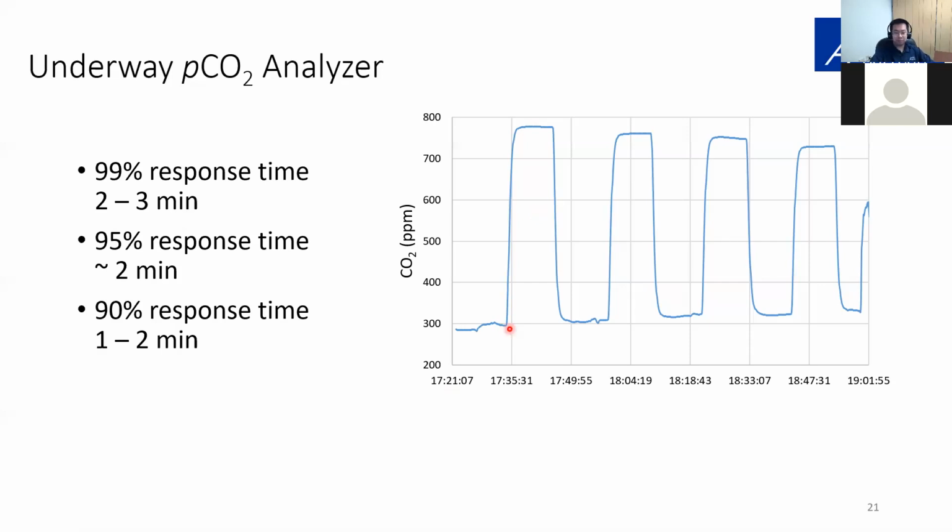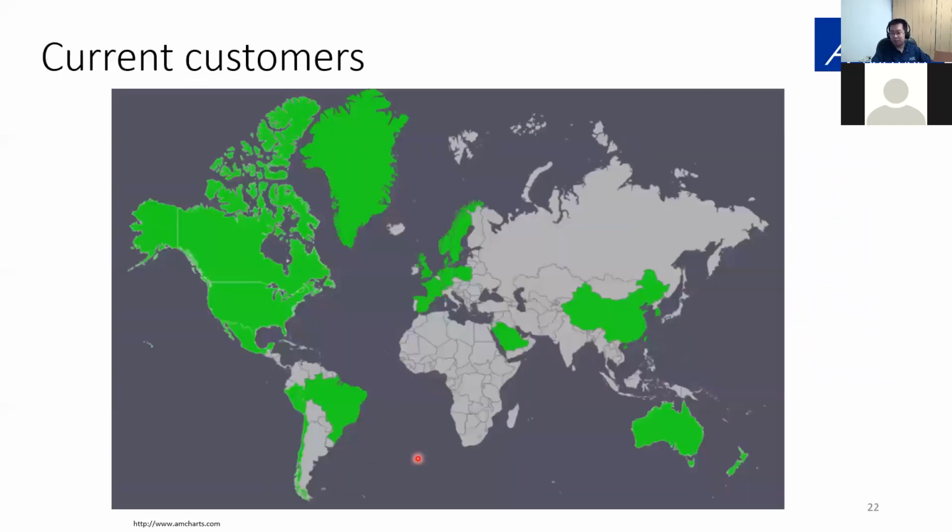With that, we got a 99% response time between 2 and 3 minutes, and 95% response time around 2 minutes. A 90% response time would be between 1 and 2 minutes. That's all I have for the analyzers.